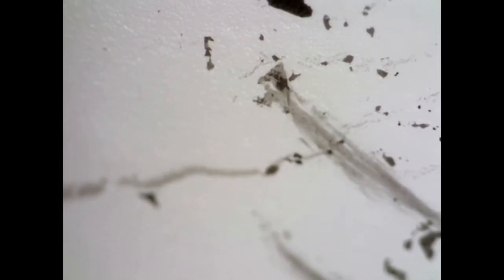There'll be high-resolution images for you to inspect at actual leisure. Here you can see we're starting to get to an area that's very white. You can see small dimples and then getting towards the lily pads, slightly getting darker, darker spots in the middle. There's a strange one down the bottom left there, a bit of an outlier.